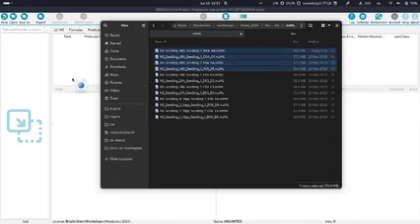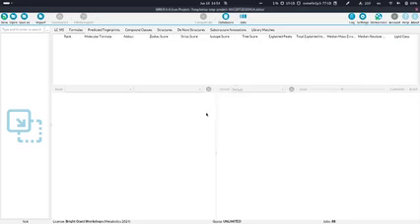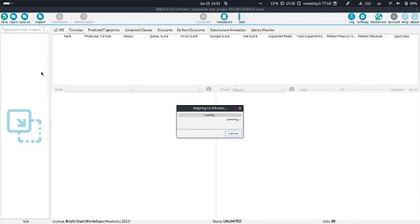Let's just drop them in. What you can do, like what I'm doing now, is select some files and drag and drop them into the SIRIUS window, but you can also, I will explain soon. First I will explain this window. Now it's telling me that I inserted multiple LCMS runs, and it is asking me if I want to align them during the import, and in most cases you should just click on yes, and it is what Kai already explained, that for the feature finding we do aligning with everything that is measured or contained in the mzml files.